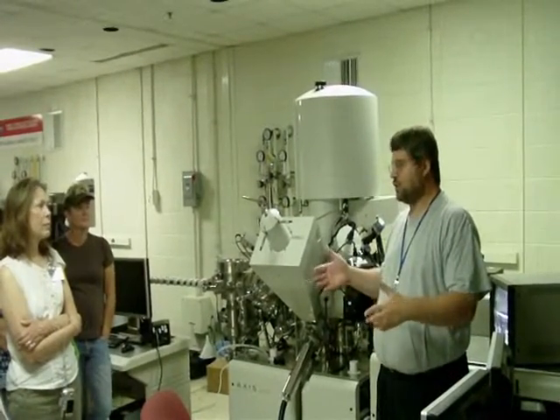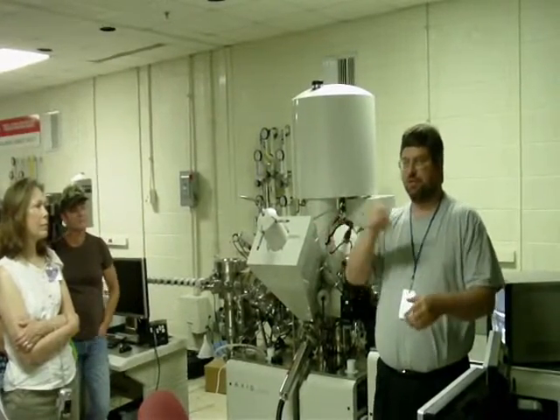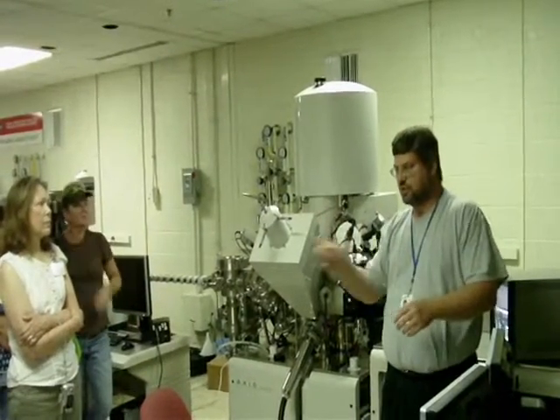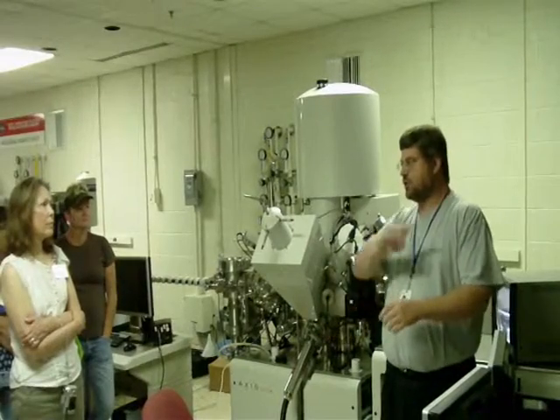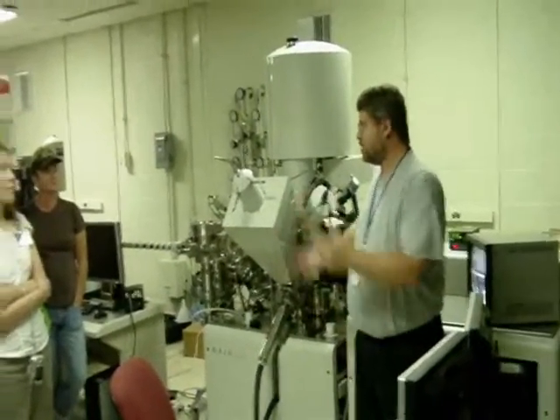It kind of works like the old televisions — it's essentially the same thing: an electron beam that rasters across the TV screen to get the image. It just does it so fast that you don't see the lines. And an electron microscope works the same way.